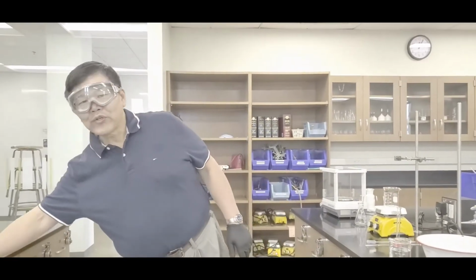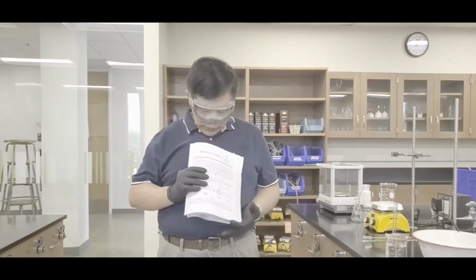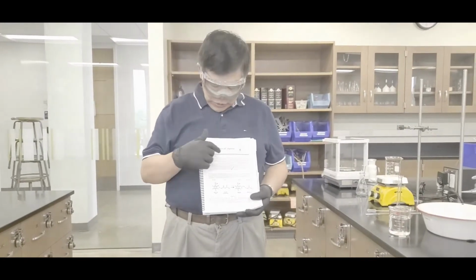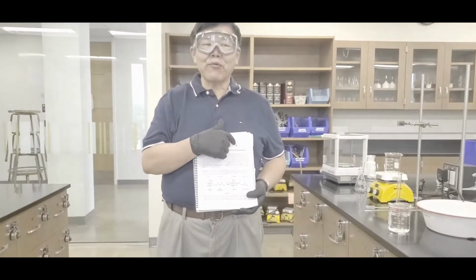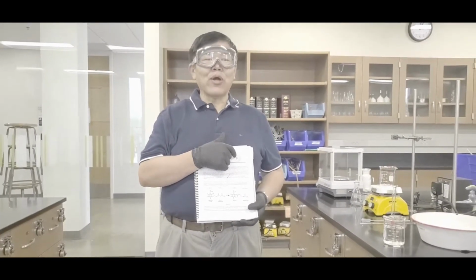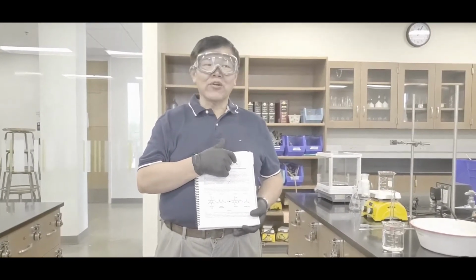Today's video, what we're going to do is I'm going to show you guys how to perform this synthesis of aspirin lab. Okay, this is number 5 on your lab manual. So synthesis of aspirin, that's the lab that we'll be doing in this particular video. Now, there are several concepts I want to show you guys in this particular lab.